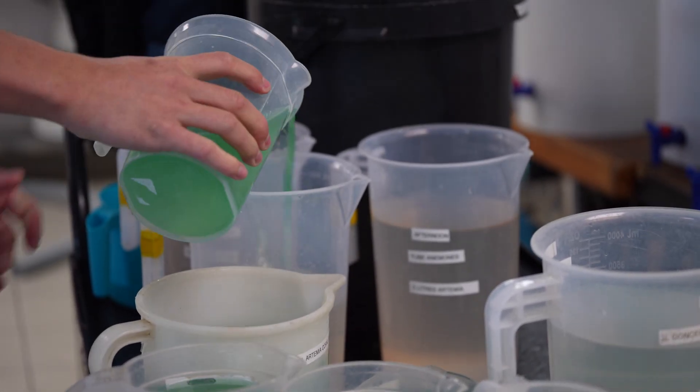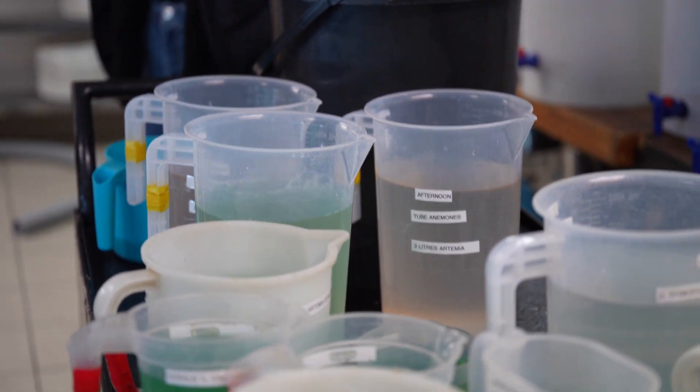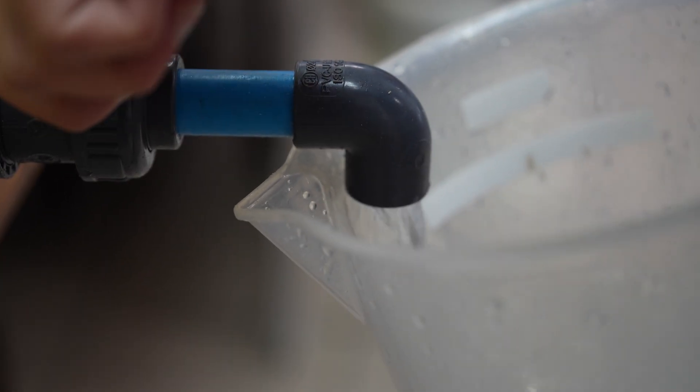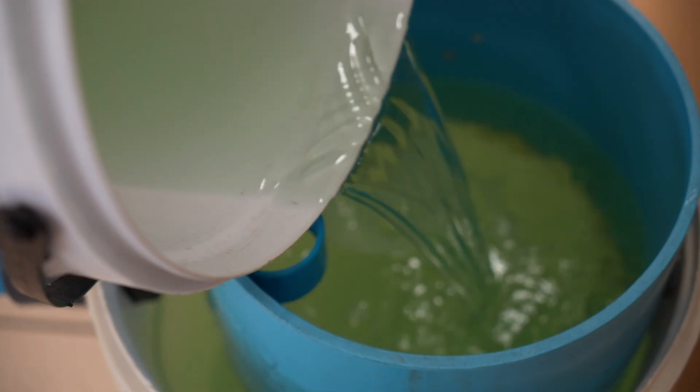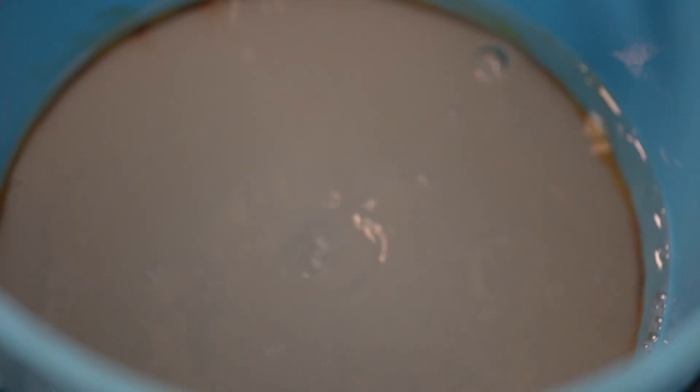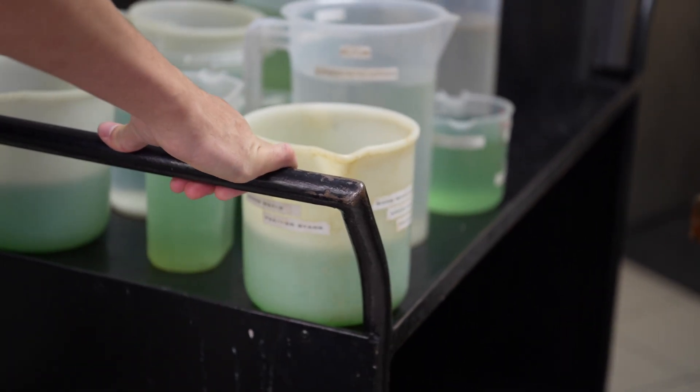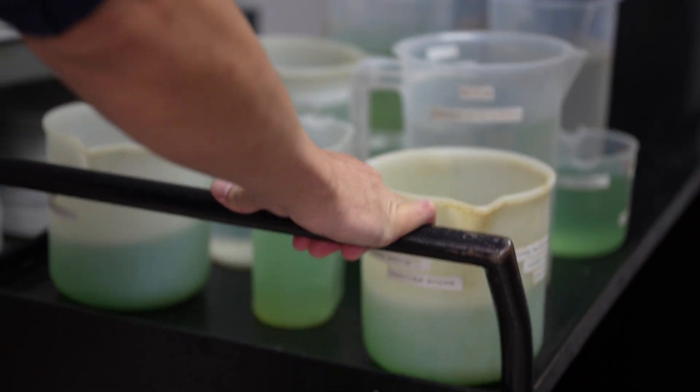Essentially what we do when we're starting a new culture is we just add some from a previous existing culture. And that's basically your baseline. And then every day we just feed them a little bit of green water and that's what they feed on throughout the day. And then slowly throughout the week, that population will become more and more dense. We have one bucket for each day of the week. Once we start a new culture, we leave it for a week for it to become more dense for the rotifer populations to expand. And then on that day in the week, we would harvest that population or that bucket. What we do is we drain it into a sieve so that we can condense the population. And then we use that to then feed and distribute amongst the different buckets that are going to go throughout the aquarium.